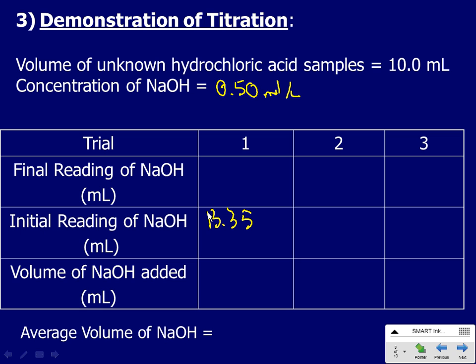Ooh, baby. That's exciting. There you can see the drops. Uh-oh. Ooh, it's close. Now I'm going drop by drop, and that color hangs around really long, and at some point it just stays. And we want the drop in which it stays.